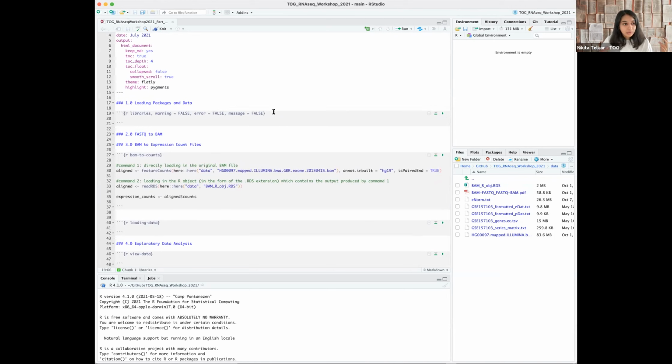Okay, so when you start R, and I'm assuming there's a few R beginners here, in R, you work with certain packages to perform certain functions. Now, each function can be done in a different kind of way. So you can use two different commands or more than that for the same exact output that you want. We will be working through a language called the tidyverse, which is a bit more intuitive than base R, the basic level R programming that you see.